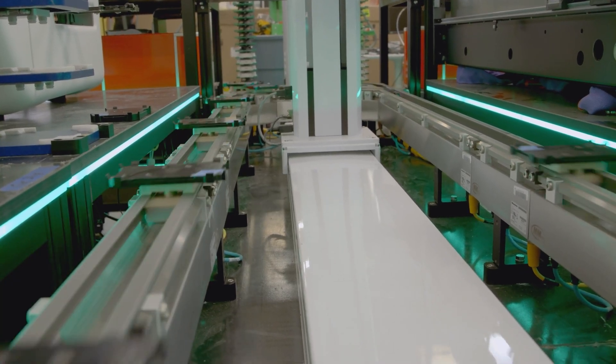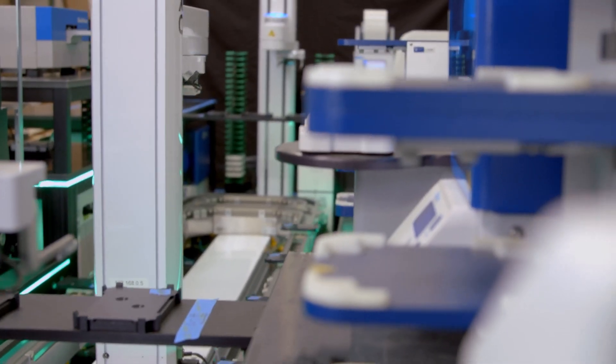As part of this, we can use multiple arm types or the MagnaMotion track to coordinate plate movements across multiple sides of the very large system that you see now.